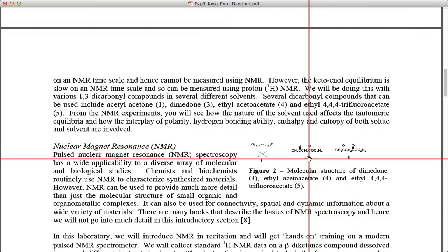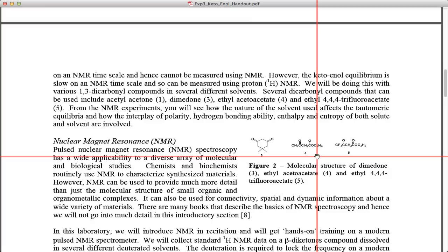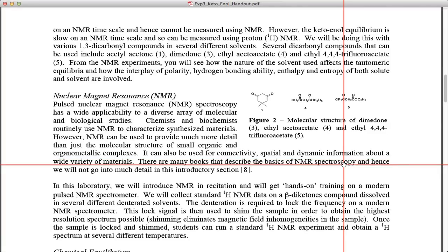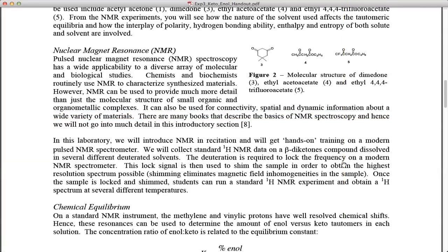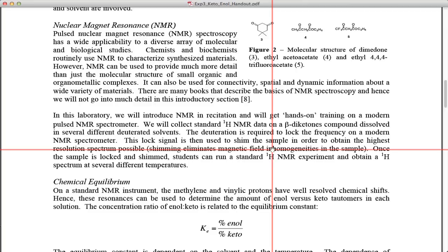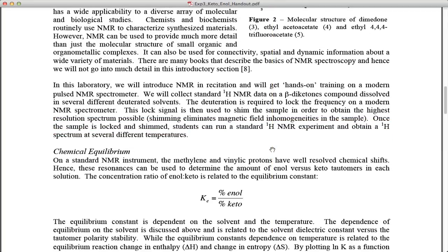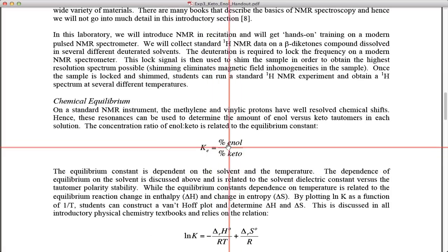Obviously this adds a few more resonances to the NMR and sets up different equilibria. The reason this is important or diketones are very important in many reactions, their equilibrium set up with an enol is what often drives a lot of organic reactions in these class of materials. Looking at this chemical equilibrium is looking at basically the percent of enol versus ketone you have in dynamic equilibrium in solution and it will change at different temperatures.